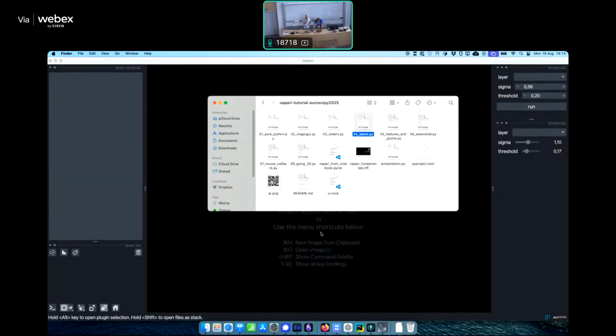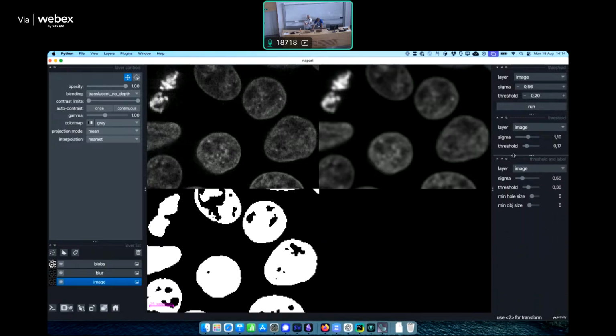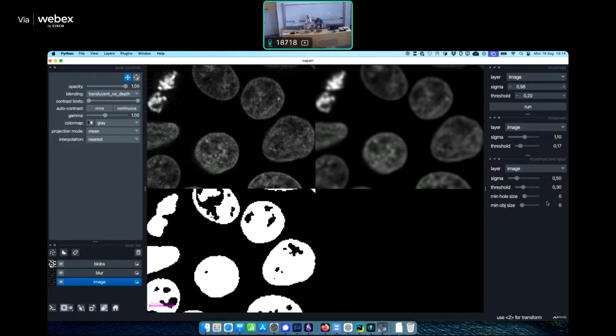And what we end up with is a slightly bigger widget with a couple more sliders. Oh yeah, that's the thing I wanted to say. Everything is kind of resizable in napari, so you can move there to the left, and now you get bigger sliders, so you're not working with half a centimeter.